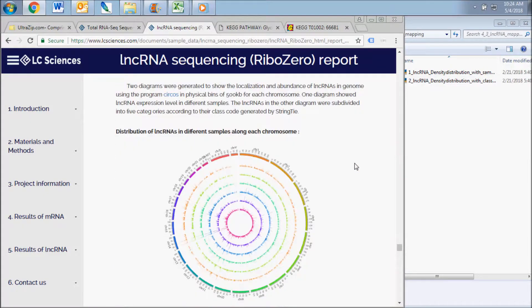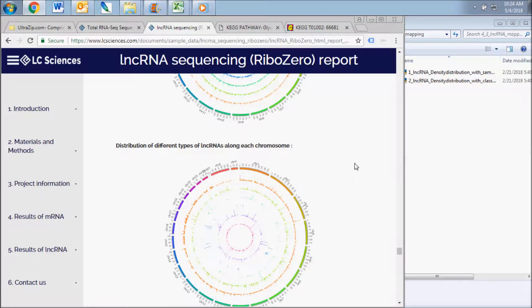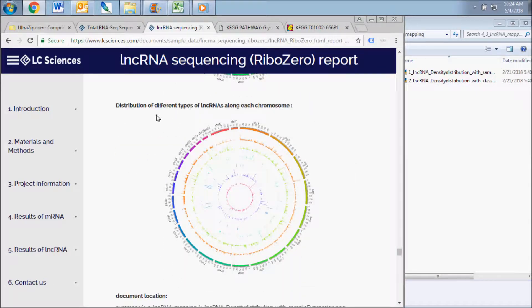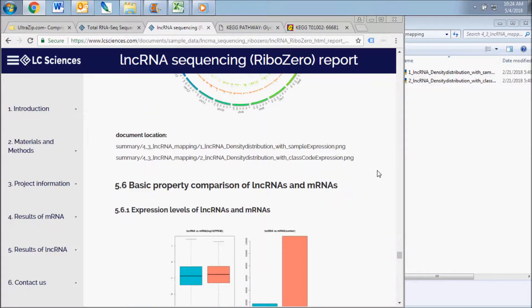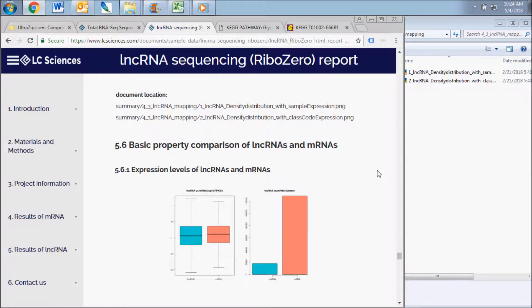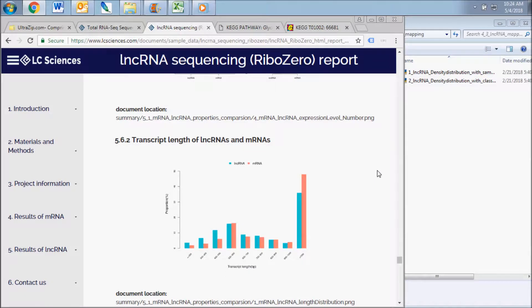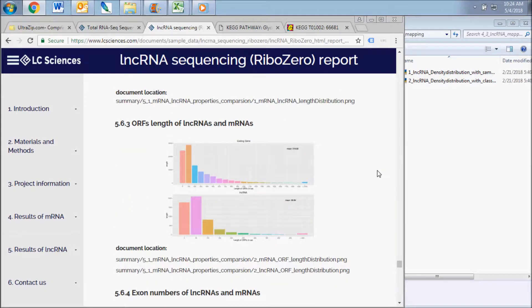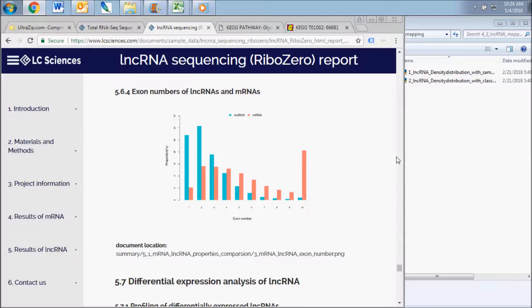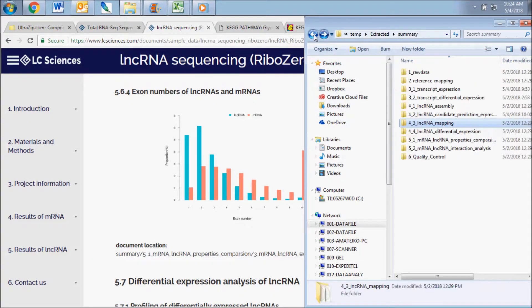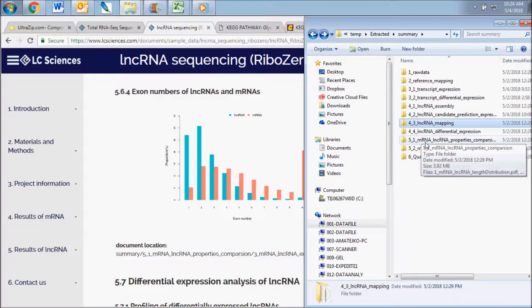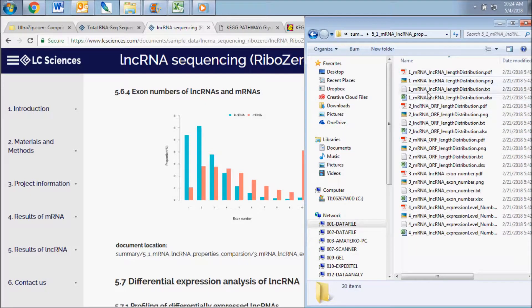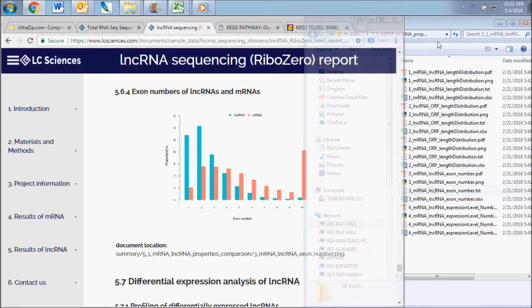This data illustrates the long non-coding RNA localization on each chromosome for each of the samples and also for each of the class codes. Below that subsection are several graphs that illustrate the comparison of basic long non-coding RNA and mRNA properties such as overall expression levels, transcript length, open reading frame length, and exon numbers. The full set of data is contained in the mRNA long non-coding RNA properties comparison folder.